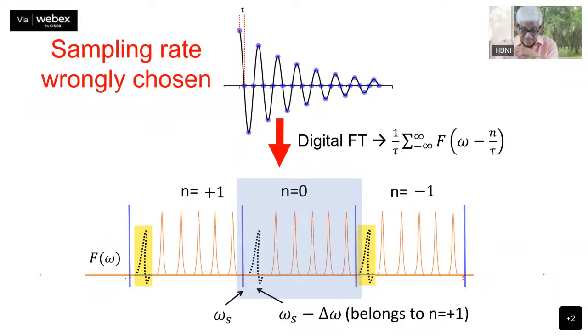Now what happens here? Suppose I have a signal in the previous as considered. I chose the spectral width from here to here, and I had a line there. I had a line here which I did not include. But it will get excited, it will get Fourier transformed. And then it will show up here from this point, it will show up as a signal here. Right?